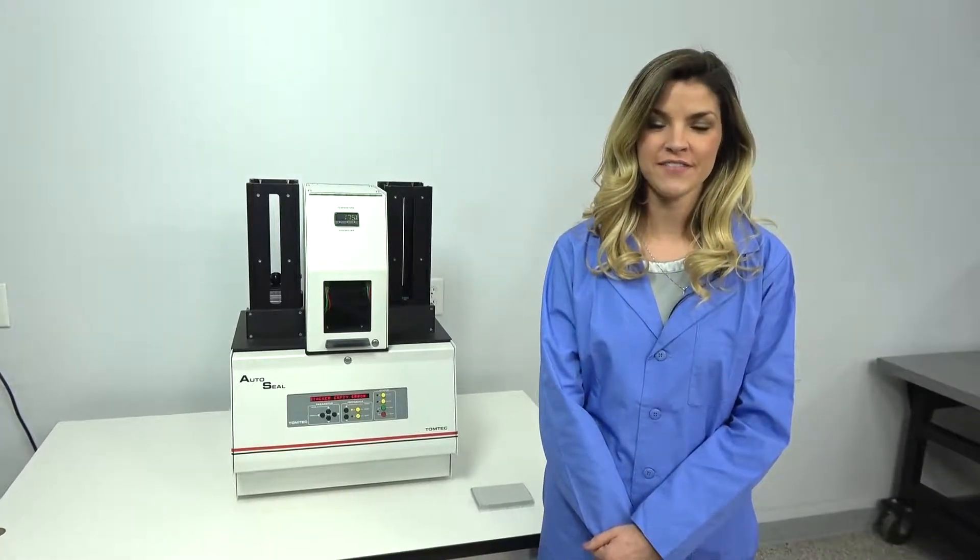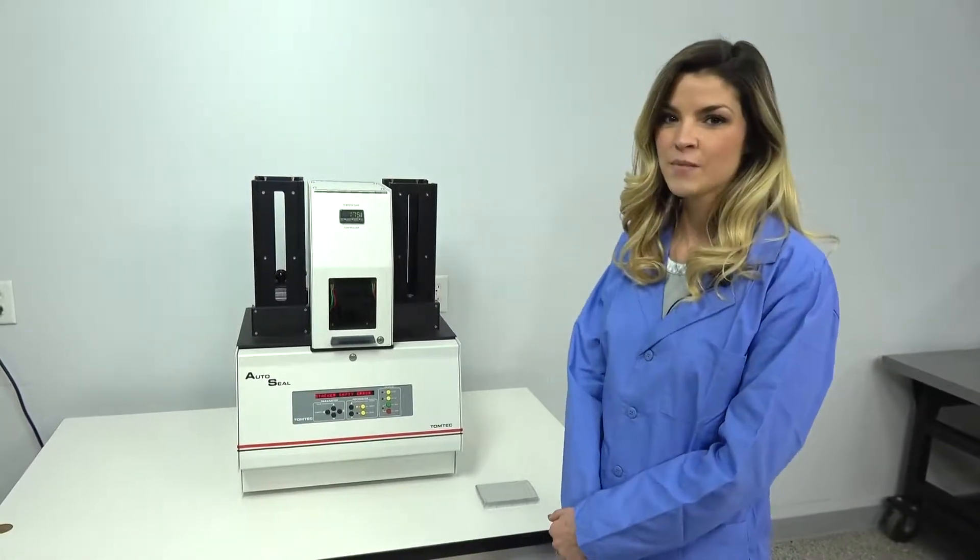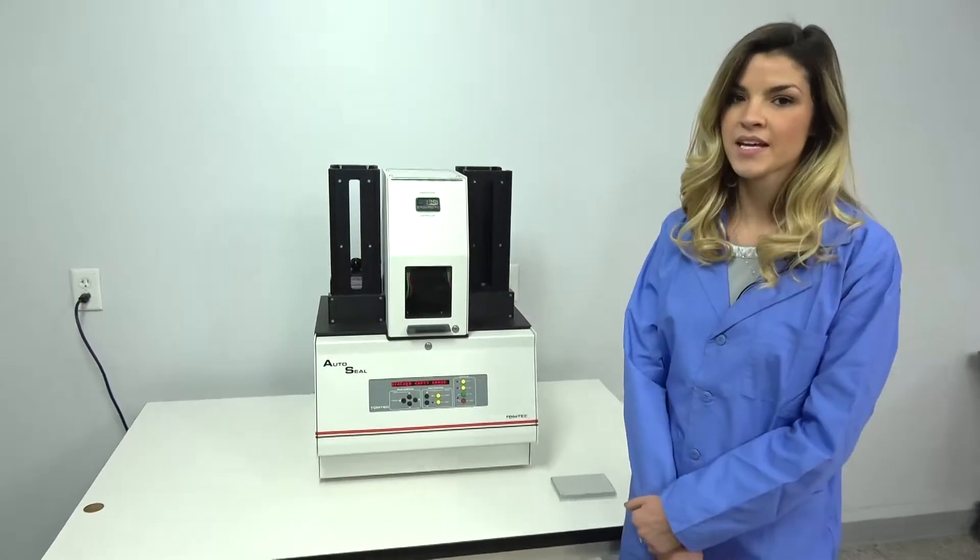Hi, I'm Heather with New Life Scientific. Today we're going to discuss the TomTech AutoSeal Automatic Plate Sealer.